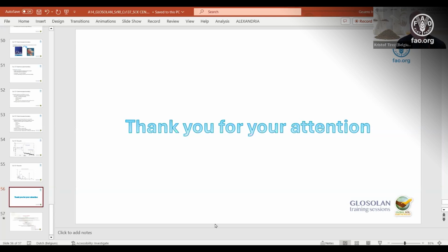Okay, thank you, Ingrid, for indeed shedding some light on the gamma spectrometry. It's a very exciting business, I would say. But indeed, you're right. I think a lot of these things need to be seen in practice, especially the calibration, energy calibration of the detector and things like that. So I'm looking at the chat, if there is any question at this point.